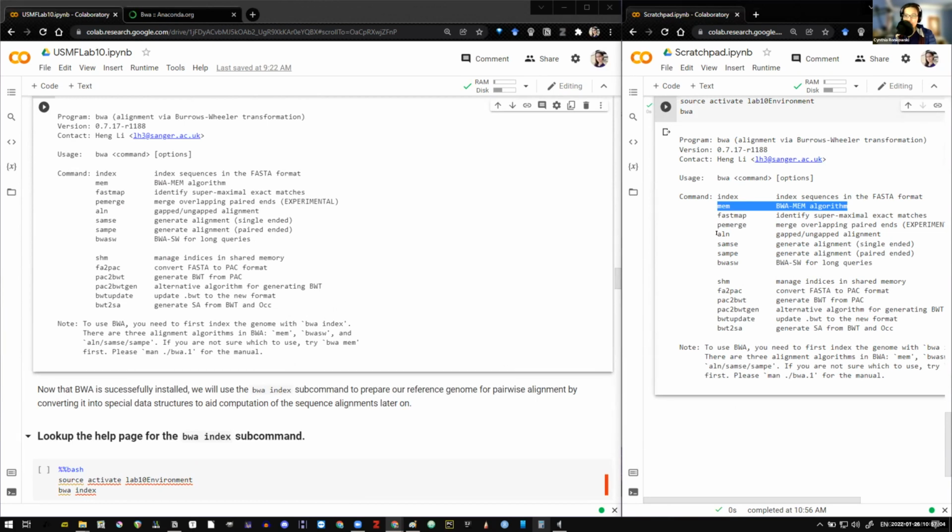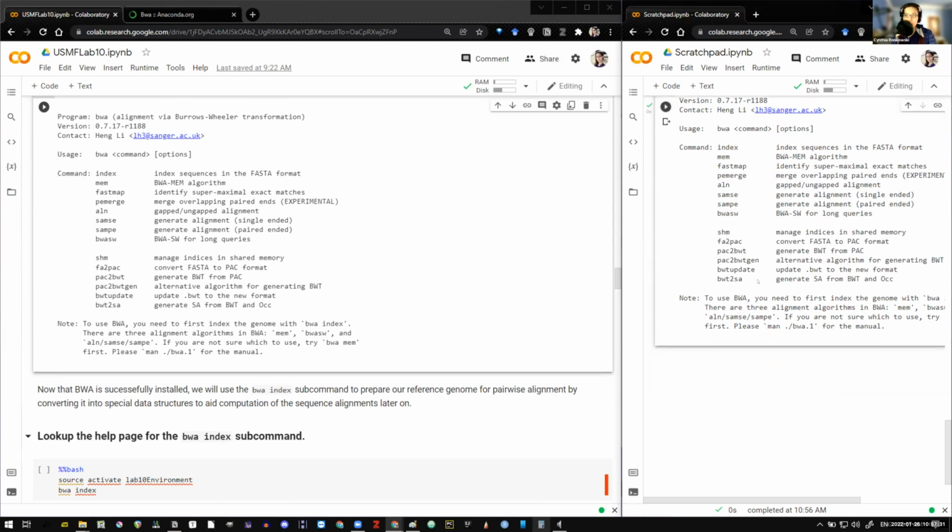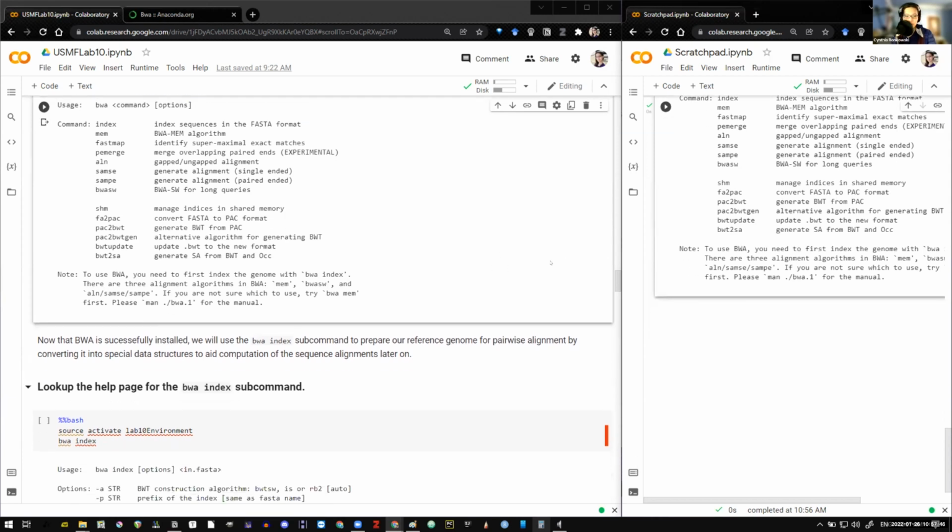For example, if you use aln instead, it may be faster or not, but it's been shown that it has less success in mapping reads to a reference. In that case, you're using less of your data, and that can influence your analyses, like, for example, p-values and statistical significance, because if you're using less of your data, then the conclusions you make will have less confidence.